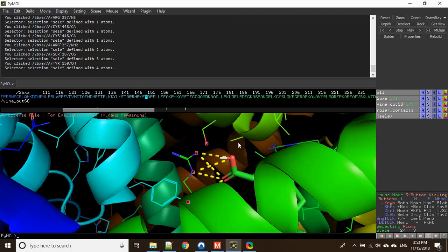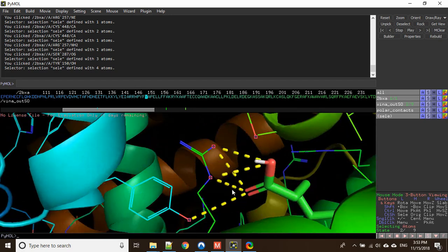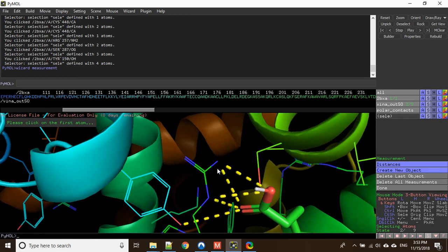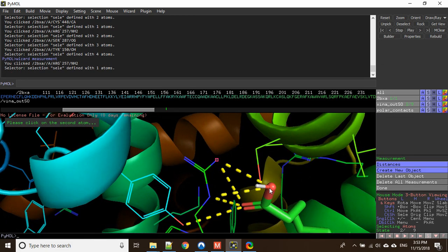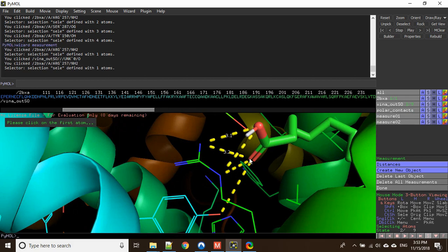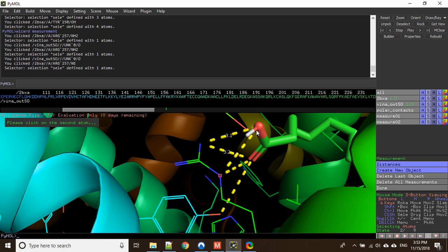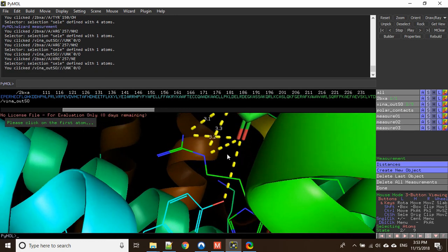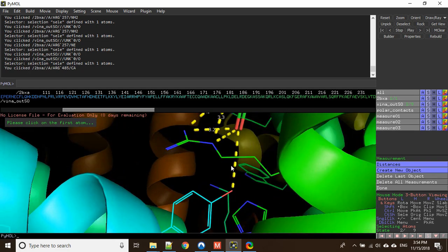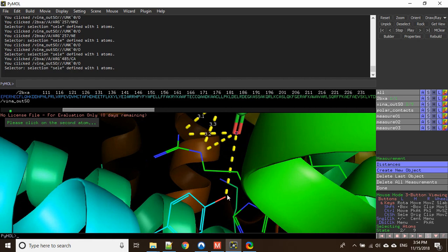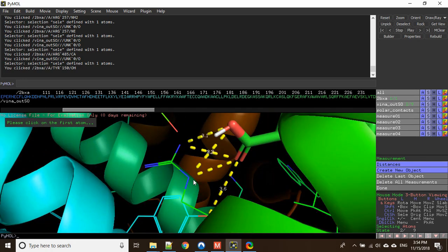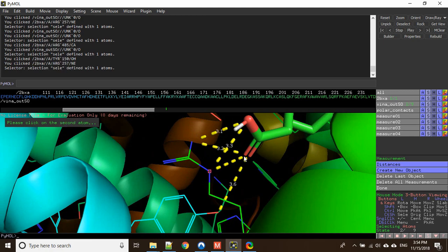If you want to measure the bond length, click on Wizard, go to Measurement, and click on the atoms. This one and this one — okay, this is 3.1. The next one is this and this — it is 3.2. Next one is 3.3. And next is this one and this one — sorry, always click on the black screen, otherwise it will be clicking other residues. This is 3.6, and this one is 3.1. So these are short bond lengths.